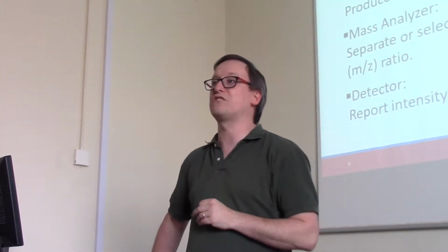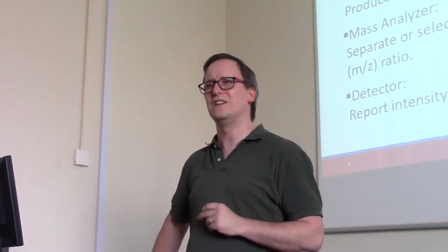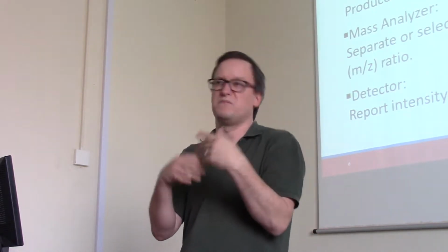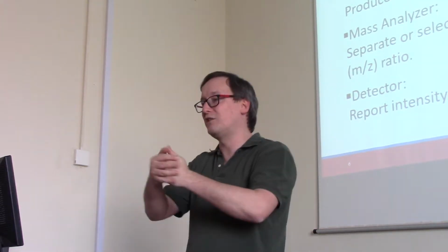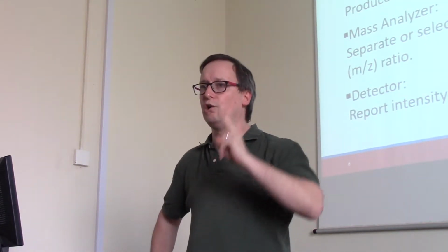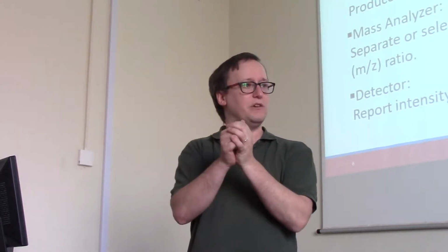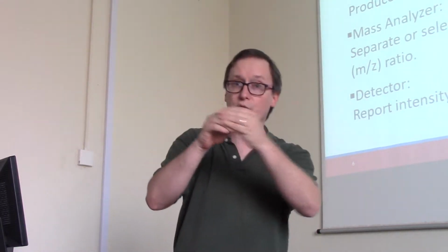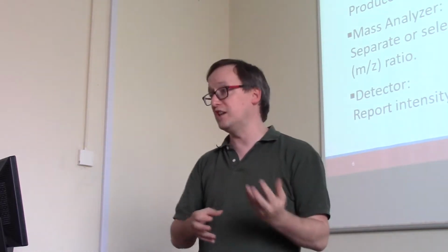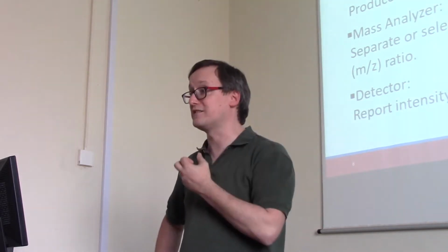The other one is electrospray ionization. I think of that sort of like a cattle prod on a water hose. You've got this pile of voltage that you're applying to all the ions that are coming out of typically liquid chromatography, which creates this spray. Both of those are called ion sources. We are ionizing some biological material. We're producing either a flow or a pulse of ions. Those in turn can be drawn into the instrument, into the vacuum environment of the inside to be analyzed.